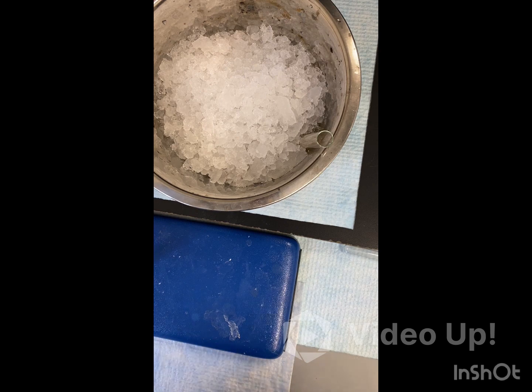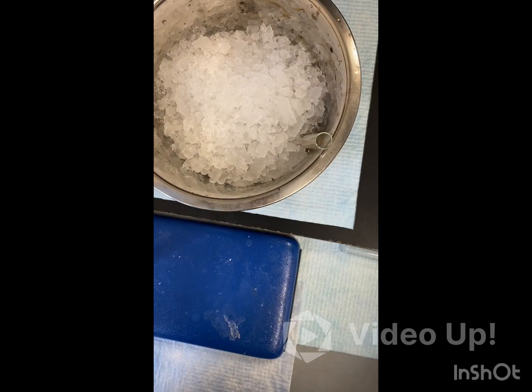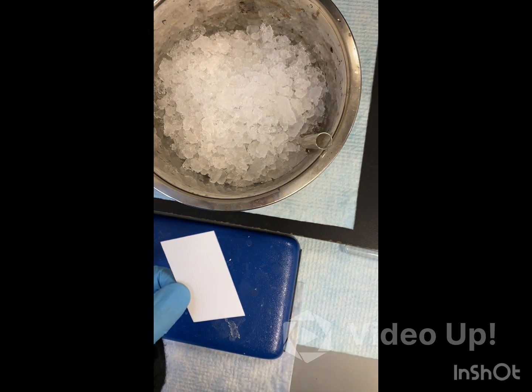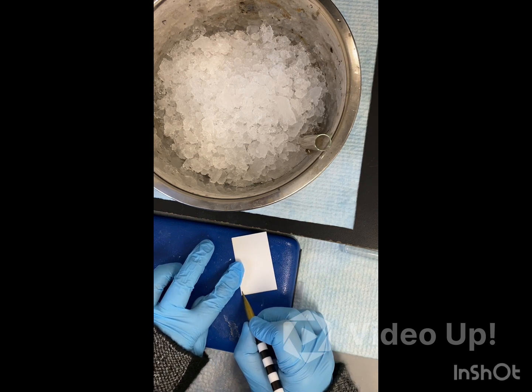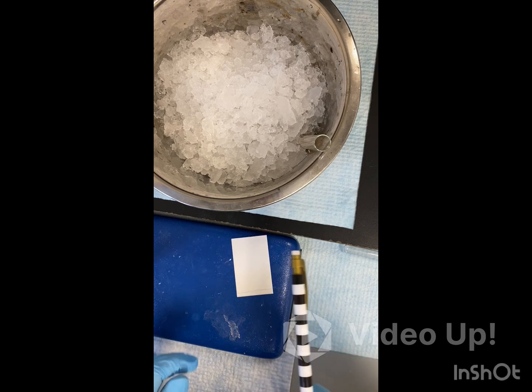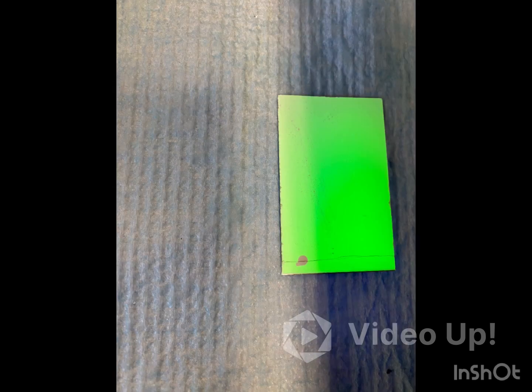While that is chilling, we're going to prep our TLC. You need a 1-to-1 hexane to ethyl acetate mixture. Put it into a small beaker. You want to mark your TLC plate — remember, you have to use pencil. We'll mark our starting point roughly. Once it's done chilling, we're going to spot it on that line. We have spotted our vanillin acetate — that will be our reference spot. We want to make sure it develops under the UV light, and as you can see, you can see the spot there.